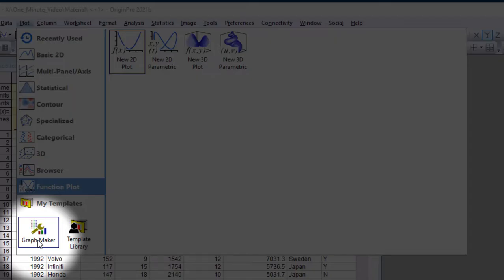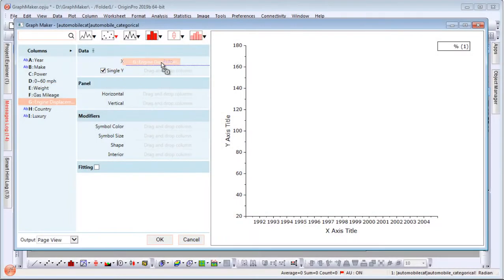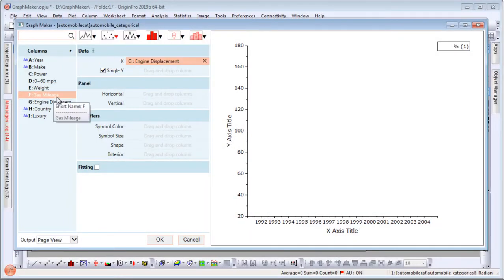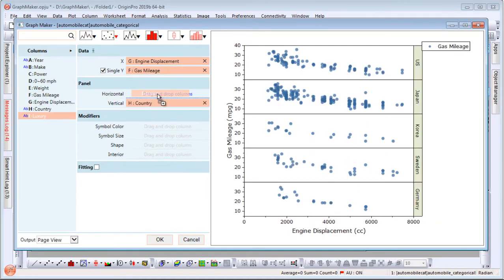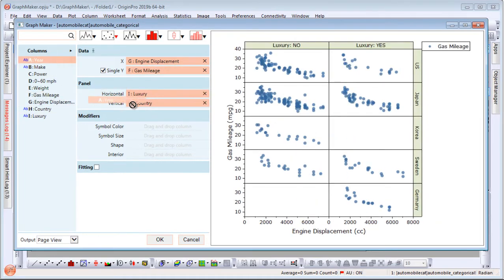The Graph Maker app allows users to simply drag and drop columns to create and customize publication quality graphs with ease.